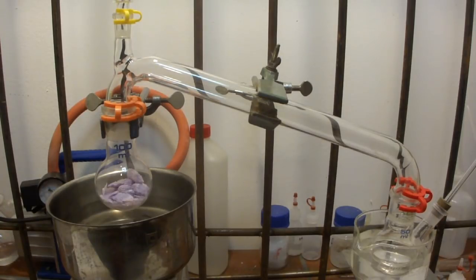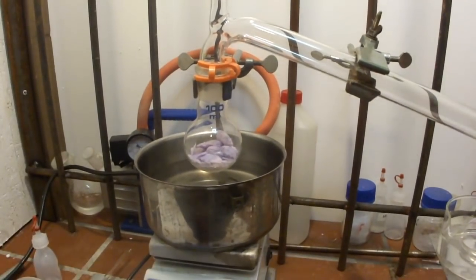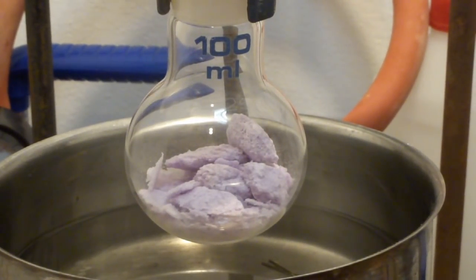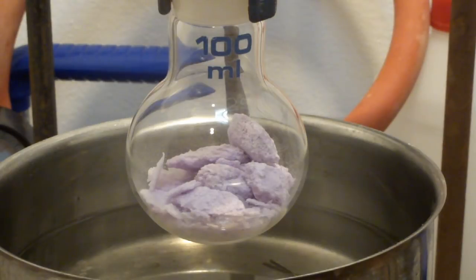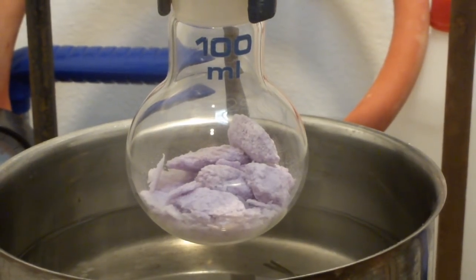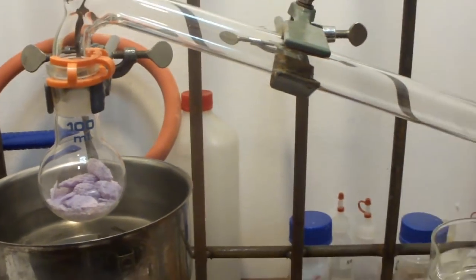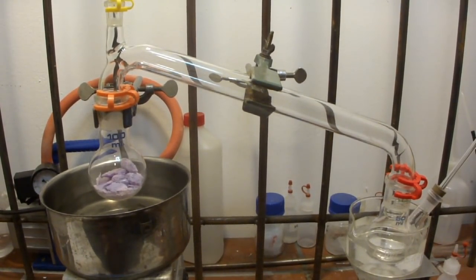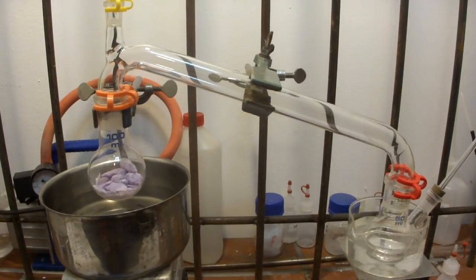Now we have already gone ahead and added the trioxane from the fuel bar to this flask. Again, as you can see, it has a slightly bluish to violet color. Now, if you want to separate the pure trioxane, you have several approaches that you could take.